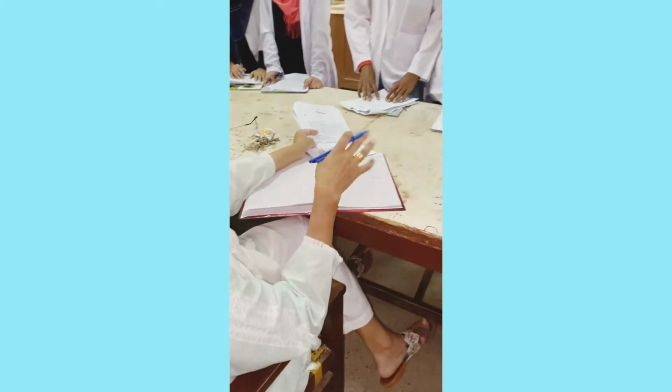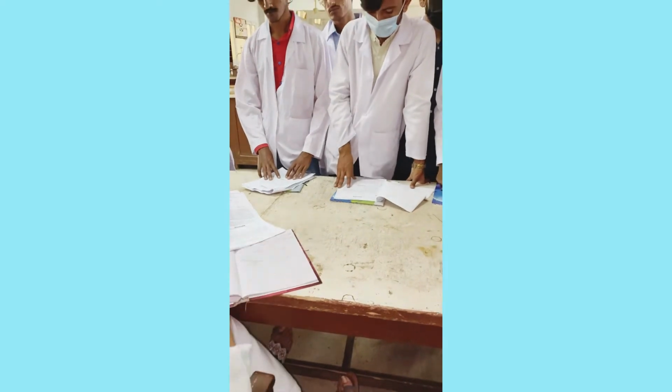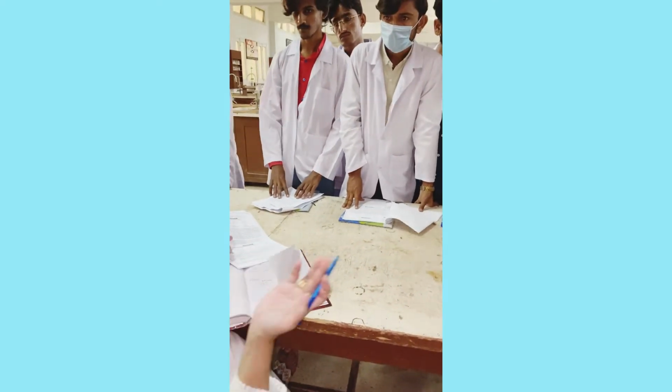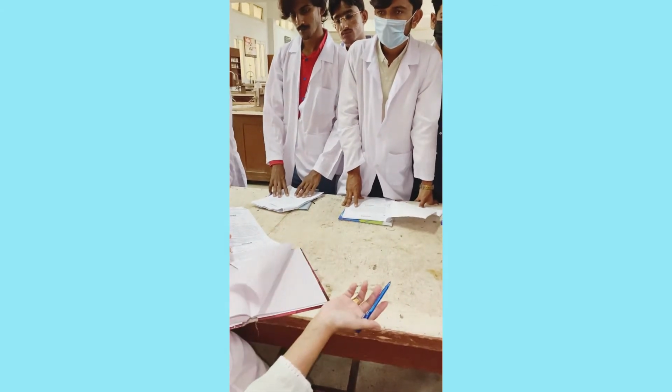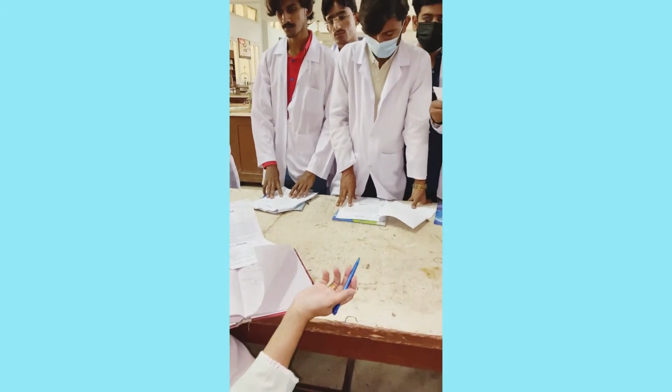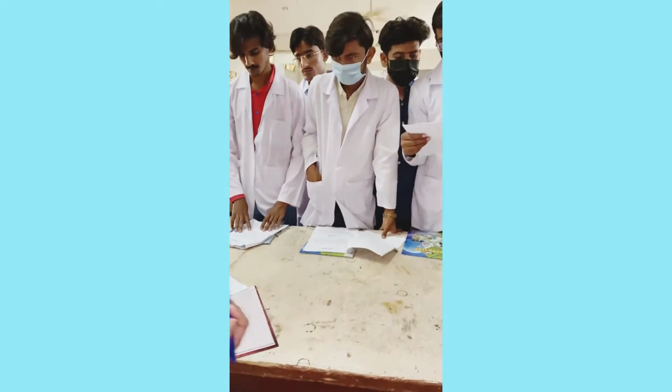Now this type of a mixture in which you are using these 2 acids, we do not repeat again and again mixture of nitric and sulfuric acid. We simply say it's a nitrating mixture. The mixture of sulfuric and nitric acid is called a nitrating mixture. Are you getting my point?